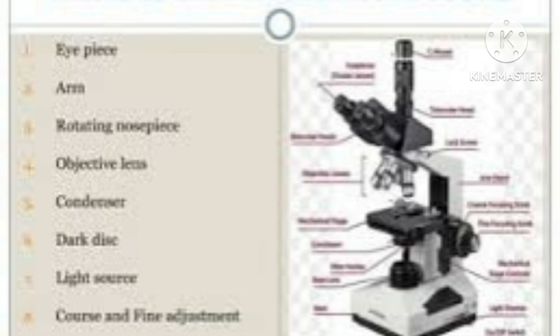It is used mostly for visualization of shape and size of microorganisms in a living state, for example, spiral-shaped bacteria. Initial examination of suspension of cells such as yeast, bacteria, small protista, tissue fractions, epithelial cells, chloroplast, mitochondria, blood cells and virus become possible due to applications of Darkfield microscopy. You can determine motility of a culture very easily with the help of this Darkfield microscope.